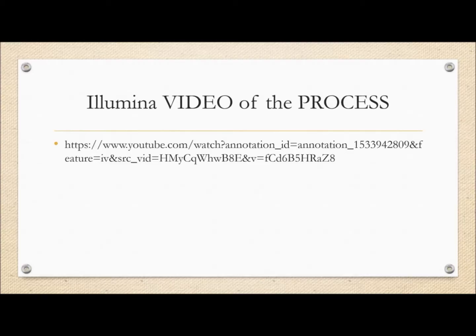You can now look at an Illumina video of the process. It's produced by Illumina, and there are other methodologies too for the amplification of the fragments that you generate. But we'll go with the Illumina description, for the simple reason that we have an Illumina, and right now they have literally set the standard for the state of the art in this methodology. Okay, so we'll watch this video, we'll come back, and then we'll talk a little bit about the video and take it from there.